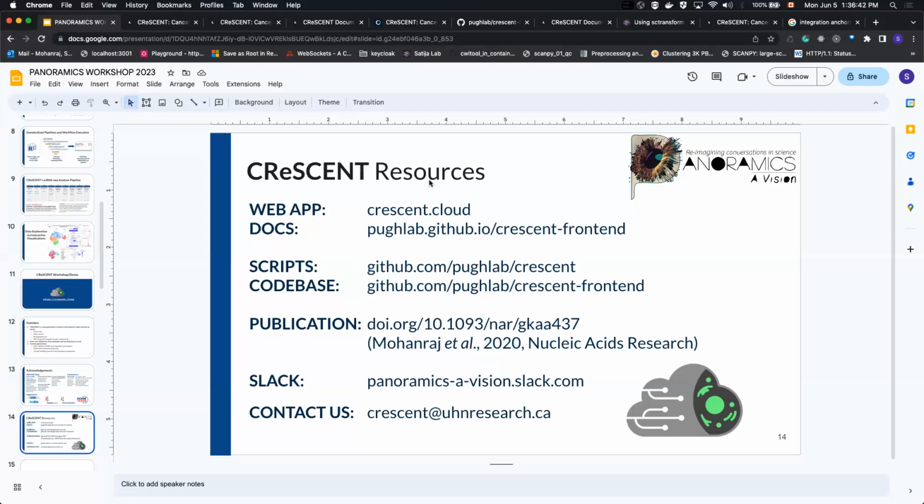There are obviously custom things that you have to do yourself, but Crescent is supposed to be that initial exploration so that you can dive into the data without a whole PhD of learning how to do single cell in R, but with a couple of clicks and cute buttons and visualizations. I shouldn't have to learn, right? They are coming with their own expertise. Exactly. So we need to leverage that.